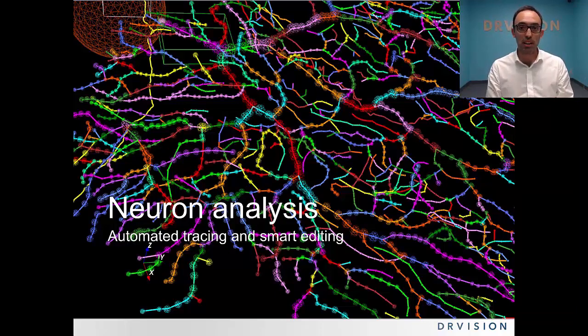And then it will come back to me to finish up with the classification tool, the cell classification tool at the very end. And then we'll finish up for today. I should say that today we're mostly focusing on what we are doing, what is possible with Aivia 5. We intend to have follow-up webinars and documentation that will show how we are doing things. And we hope that you will join us for those webinars in the future, where we'll show you what algorithms we're using, why we're using those, and what are the benefits. But that's not the focus of today.